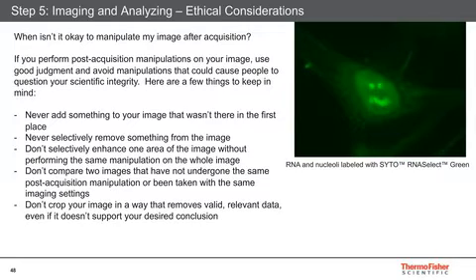Most image acquisition software will allow you to adjust the brightness, contrast, and color. Maybe you can crop it. Maybe you can adjust your raw image and resave it in a certain way. That's okay, but there's some guidelines you need to follow.